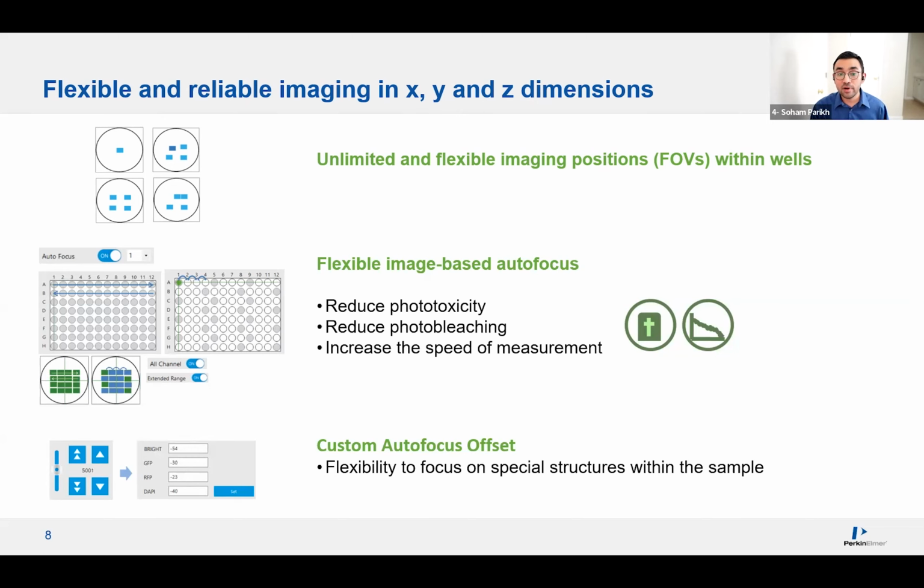So for people who are new to the live cell imaging world, phototoxicity is basically this: if you emit light to the fluorophore, because of the fluorophores present, your cells would start producing reactive oxygen species, and your cells would start exhibiting some of the phototoxicity. So with the MuviCyte modes, you can actually eliminate that a lot.